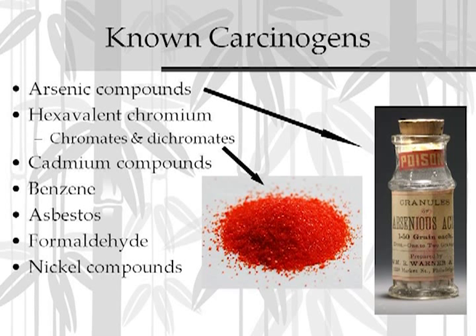The other place where we see the hexavalent chromium compounds, the dichromates in particular, is ammonium dichromate being used in the famous volcano demonstration, where essentially it's set on fire, and it does make great sparks and flaming red glow and the whole bit that makes a very active and exciting volcano. The problem is you're generating carcinogenic smoke coming out of it, and you're creating a hazardous waste that's very difficult to clean up. So this may be one that, even though it's a really great looking demo, the risks again may exceed its educational rewards.